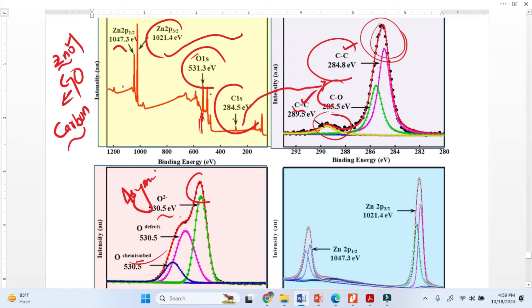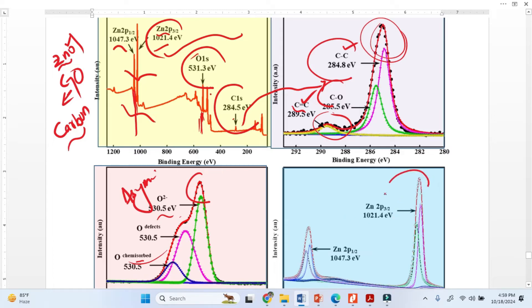We usually say the doublet is not visible in the survey spectrum, but in some instances it is visible, as it is here. However, it is still a little difficult to identify the exact binding energy. So we deconvolute this peak as well, and then the binding energy becomes very clear.